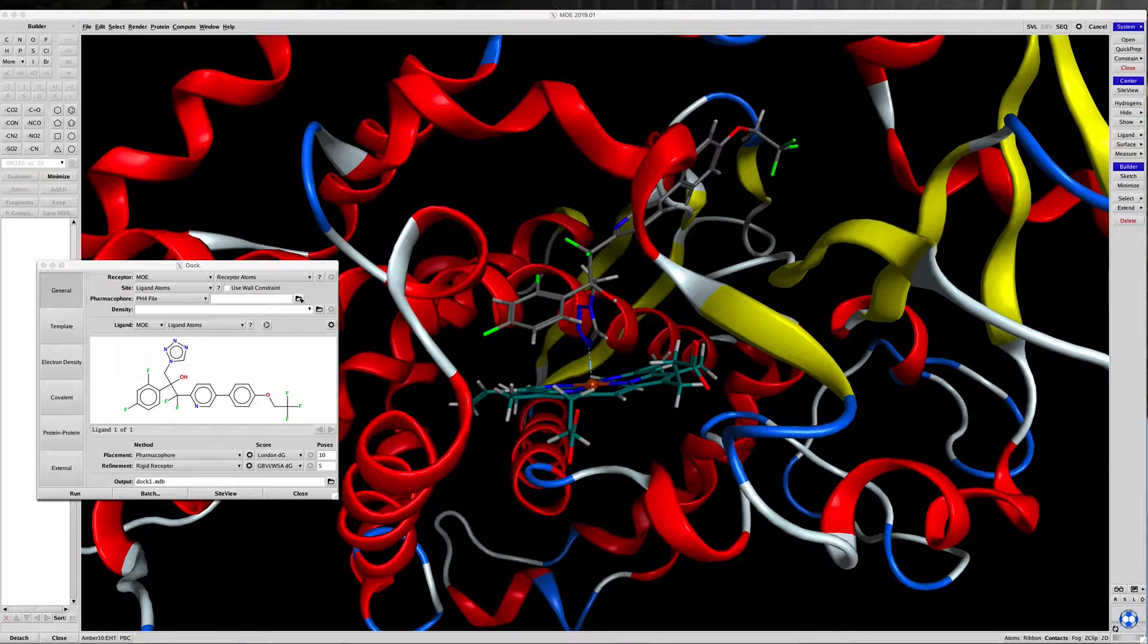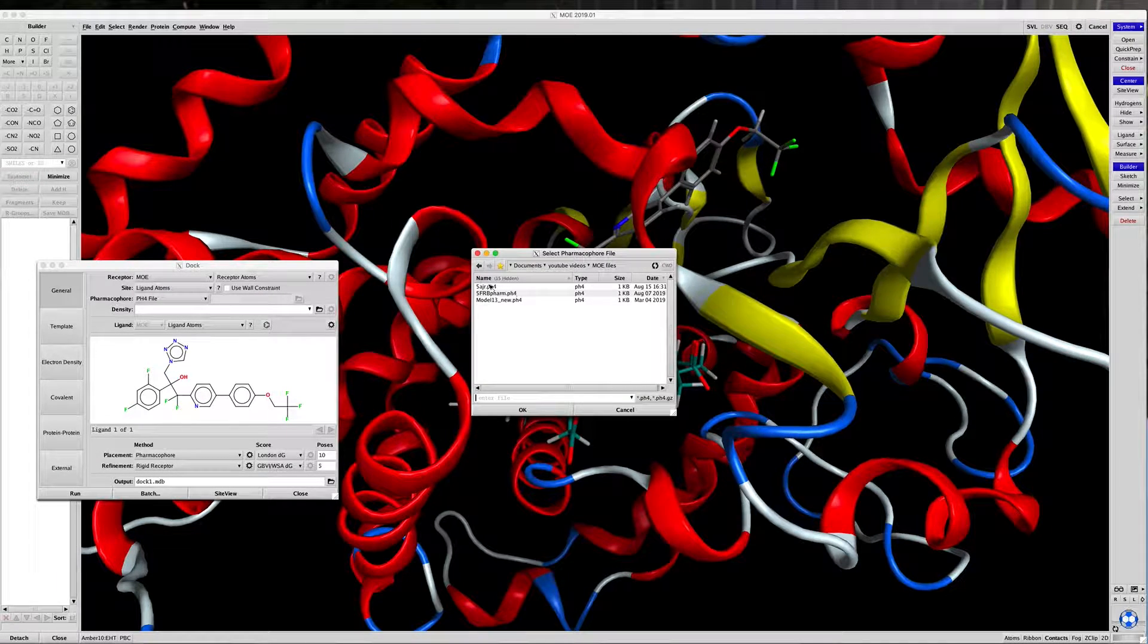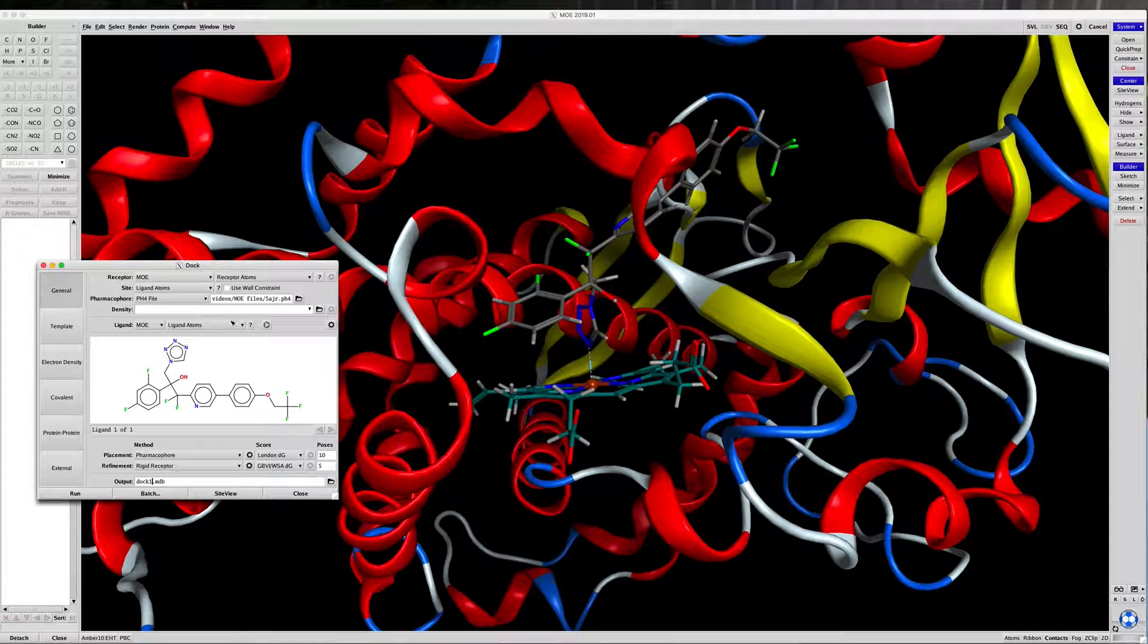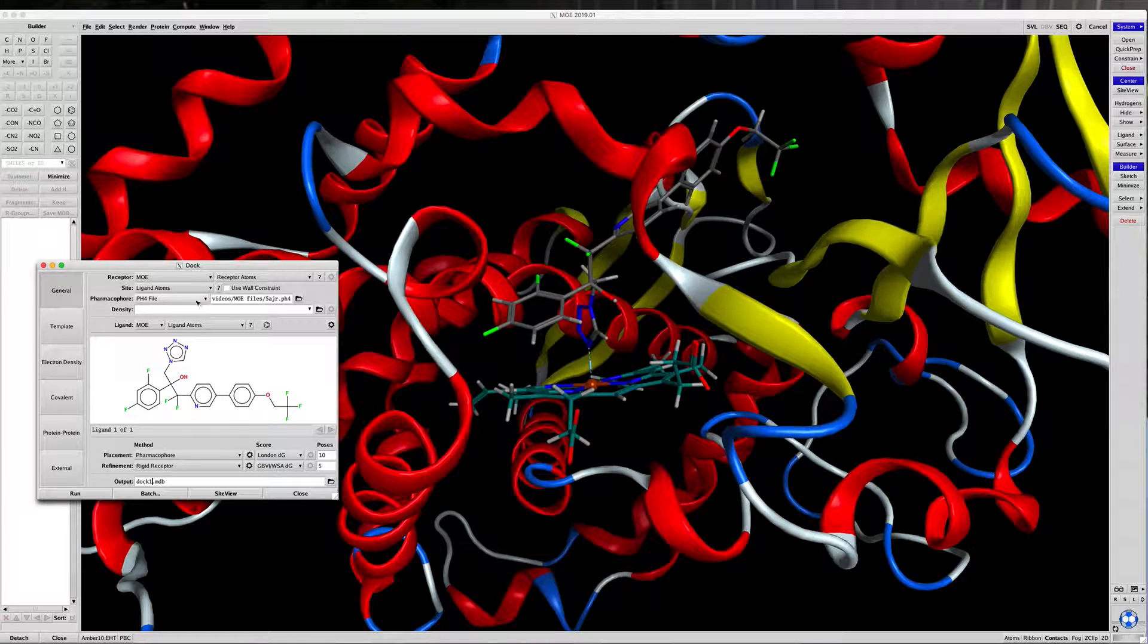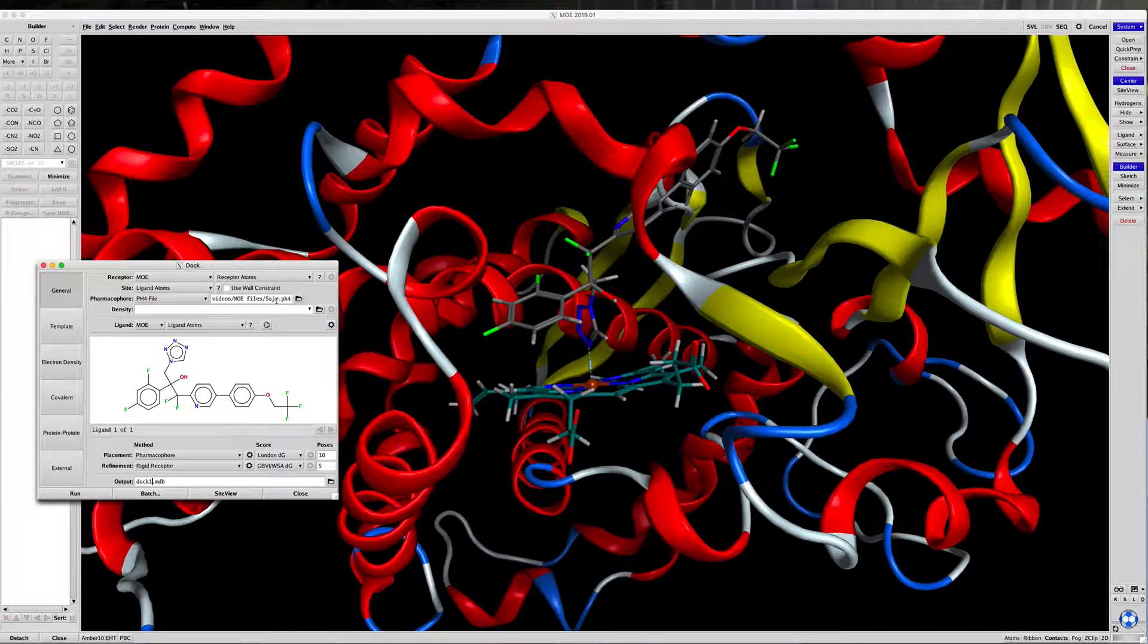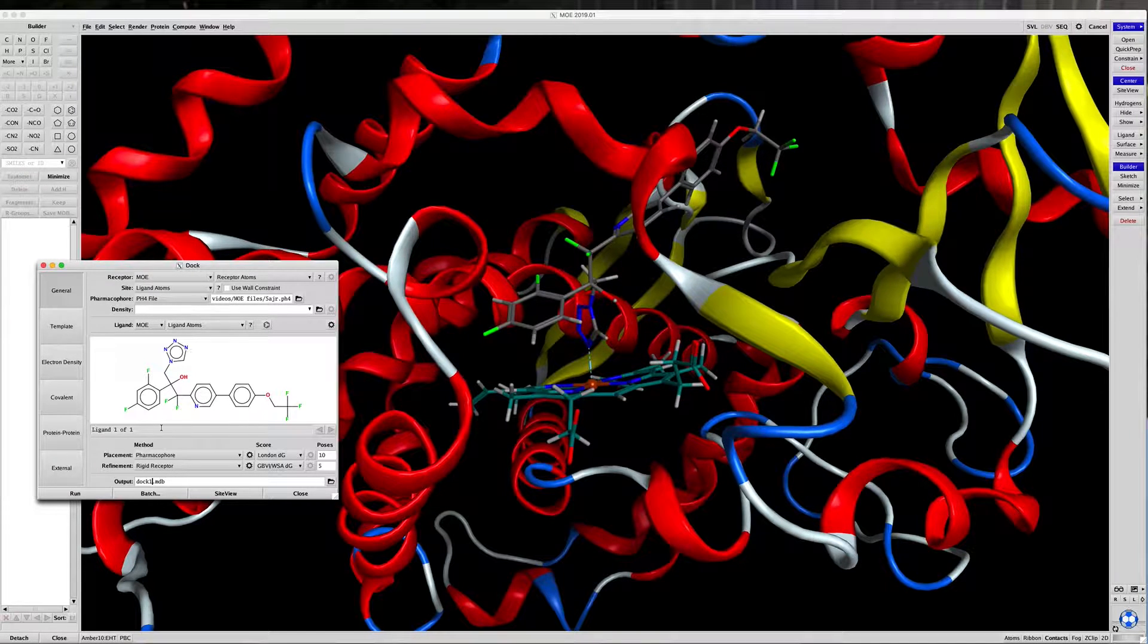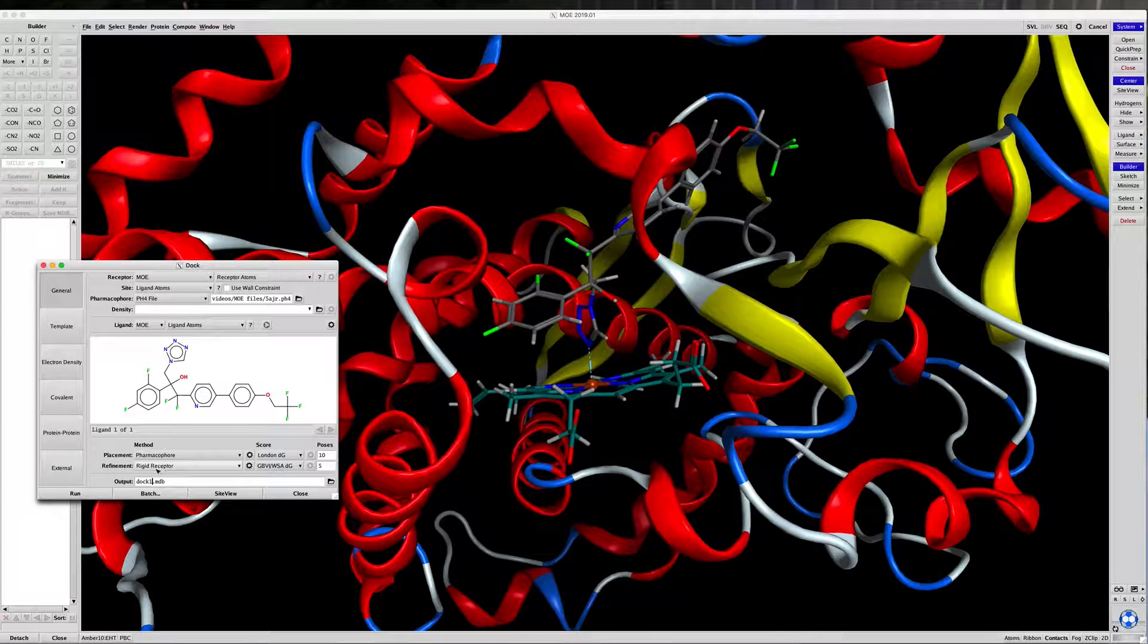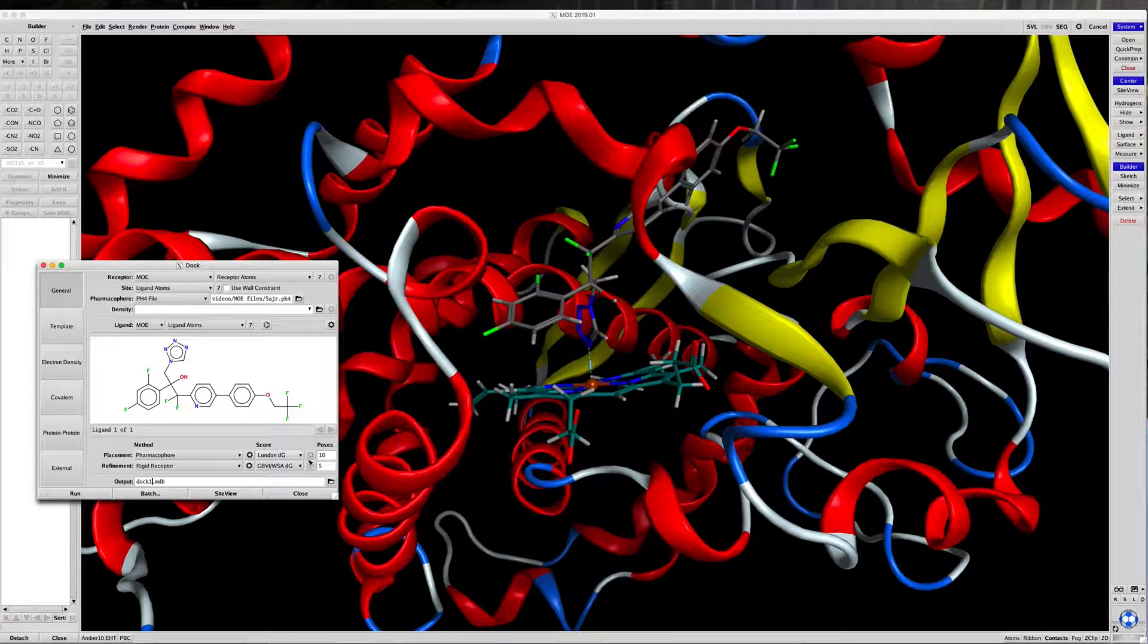Click and find it, and load it into the docking software. So we're using a pharmacophore placement. The refinement and scorings are the same.